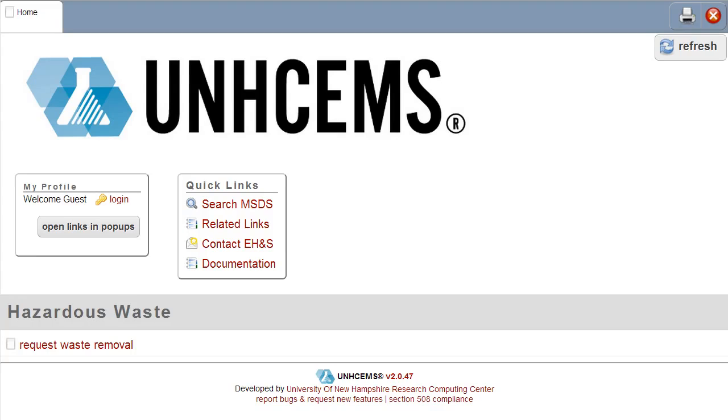What you see on the screen right now is the dashboard. When you go to your UNHCEMS system and have not logged in, UNHCEMS identifies you as a guest user. The guest user has limited access to the system. You can search for safety data sheets and submit hazardous waste pickup requests.